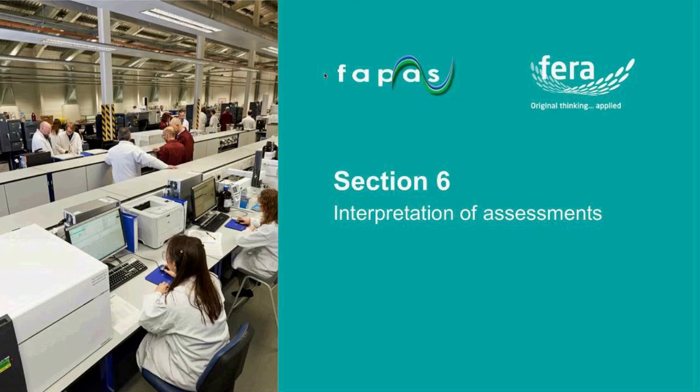Section 6. Interpretation of assessments. So this is about receiving your Z-scores, what they mean, and importantly, what should you do with them in the long term.